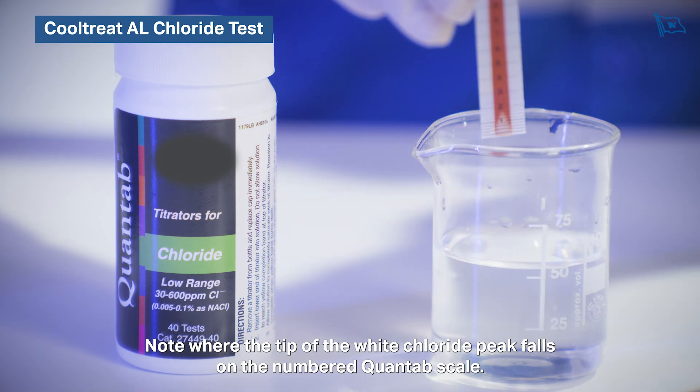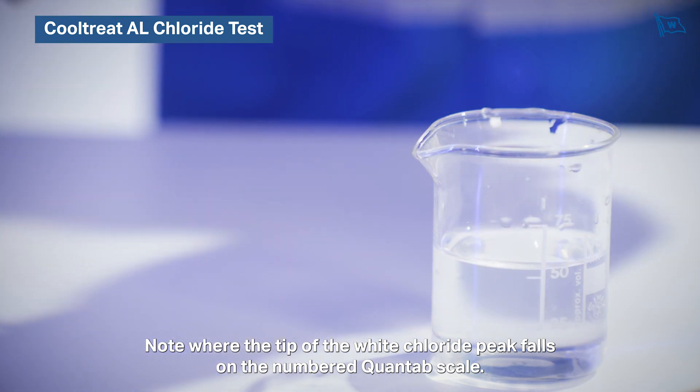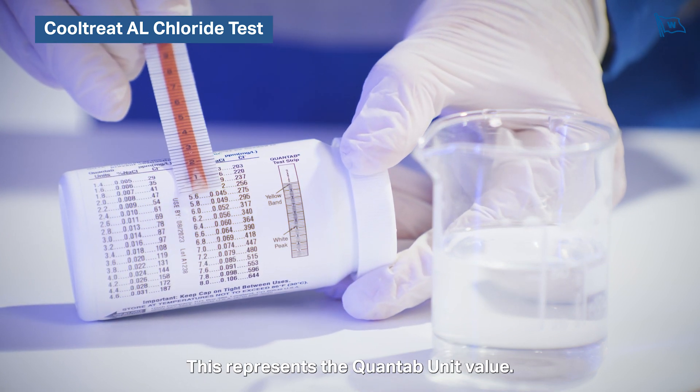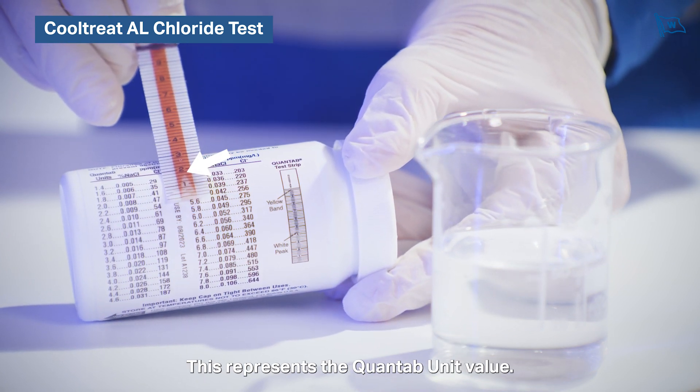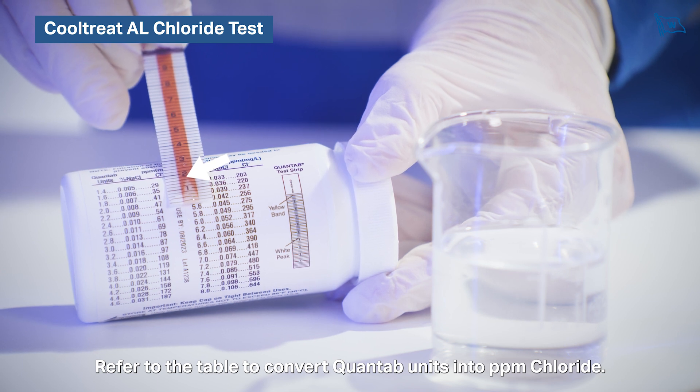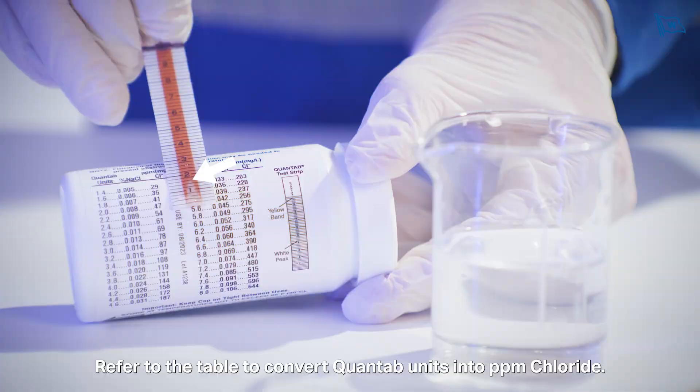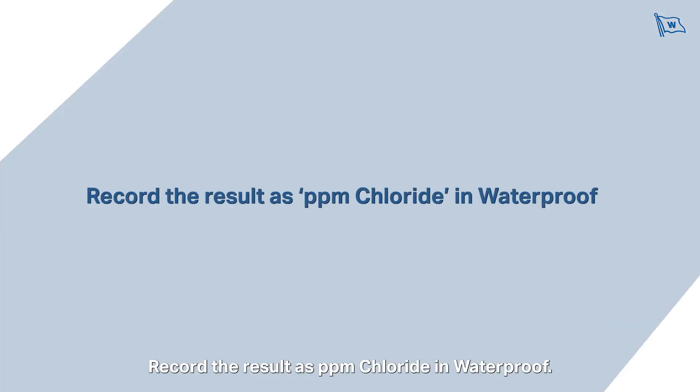Note where the tip of the white chloride peak falls on the numbered Quantab scale — this represents the Quantab unit value. Refer to the table to convert Quantab units into parts per million chloride, and record the result as parts per million chloride in waterproof.